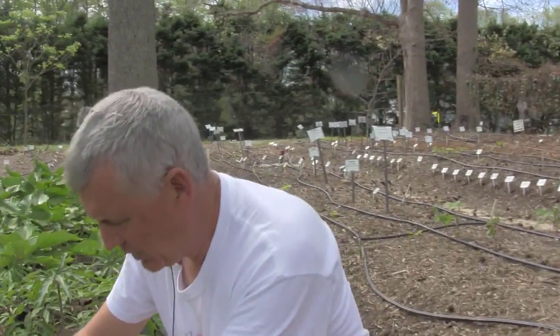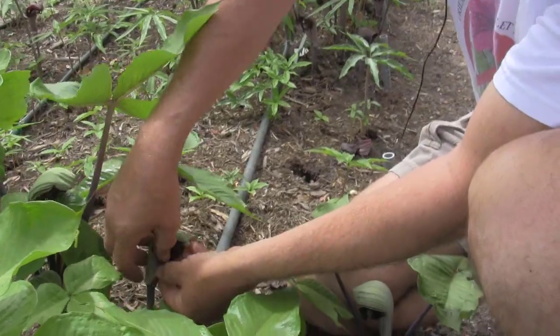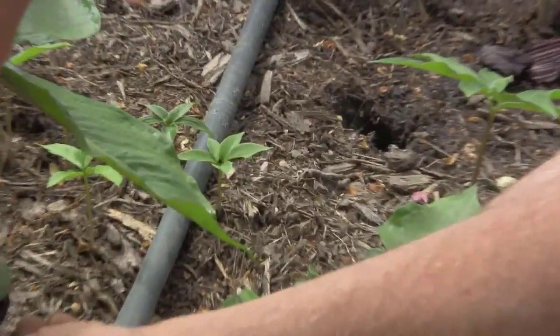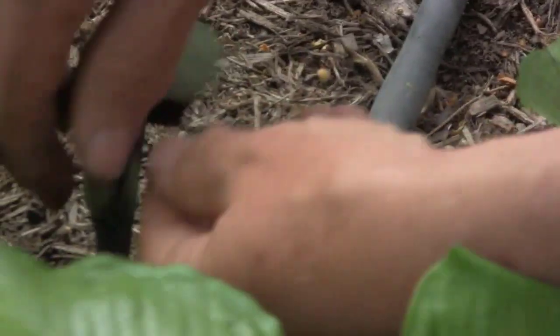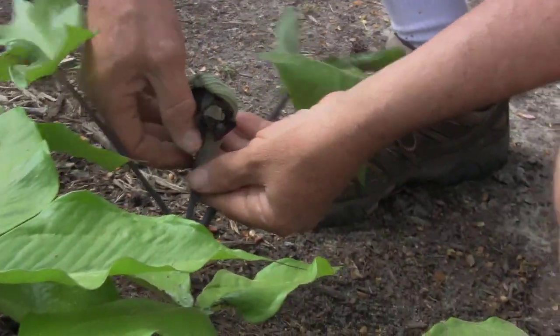The first thing we're looking for is a male to get the pollen. We look inside each flower, and when you do this enough you can actually begin to tell before you look. Now there's a female, and there's a male. So the first thing we do is dissect the flower. Here's my male.